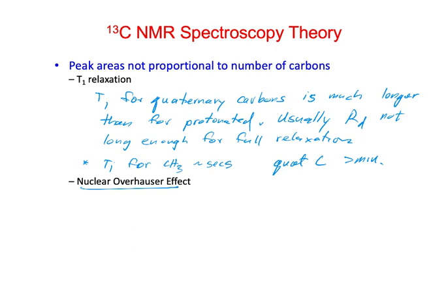And so we see signal enhancement. That comes from signal being transferred from proton to C13. And theoretically, this enhancement could be on the order of 0 up to actually 3 times.